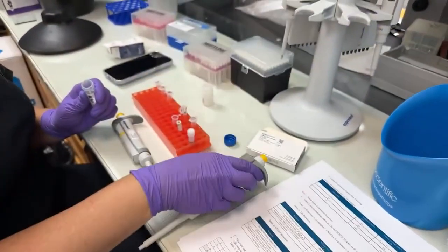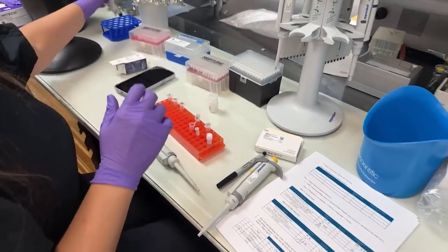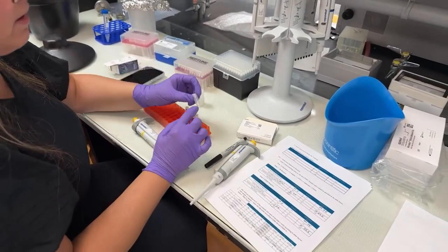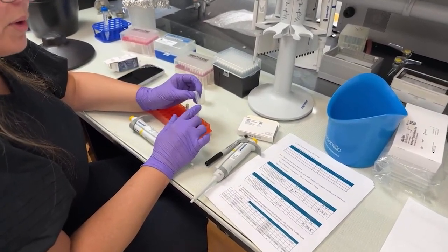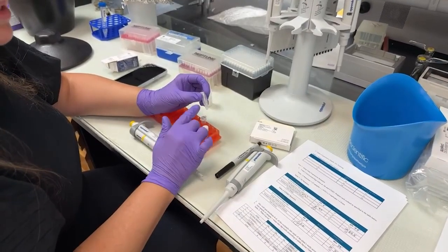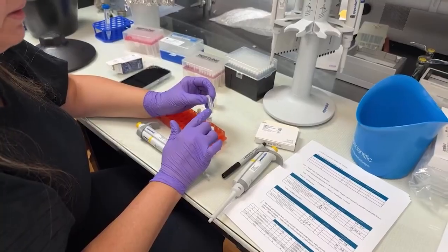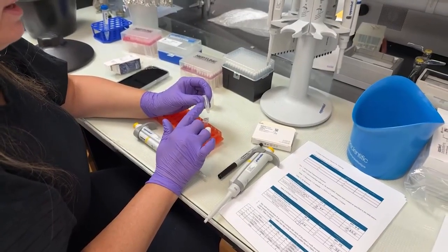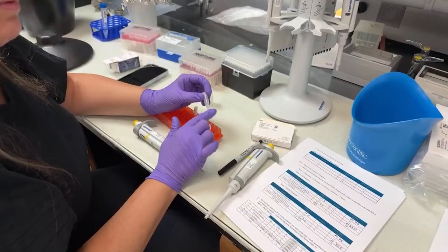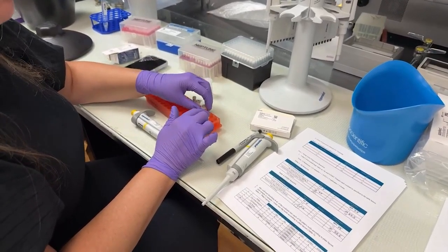We dispense our 37.5 microliters of water. And now these are all of the primer, probe, water, and enzyme, NTPs, and everything we're going to need for our individual reactions in bulk. We will then mix this and aliquot it into the plate when it's time for that. And then I'm going to add our samples to it.